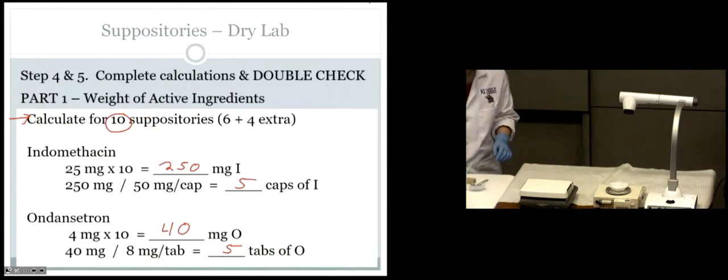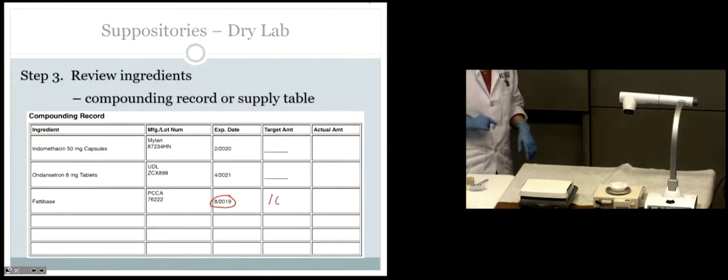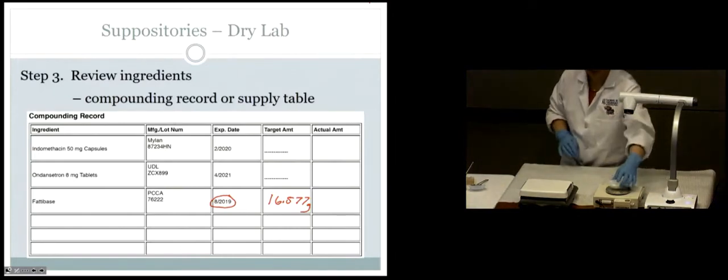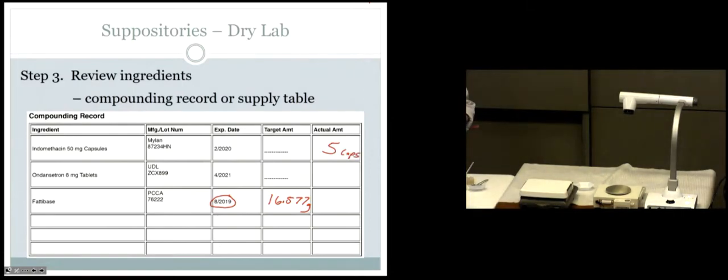Because now we know some things right over here. So, your target amount for the fatty base is going to be, what did we just say? 16.577 grams. And how many capsules are we going to actually use? 5 capsules. And we're going to have 5 tablets.